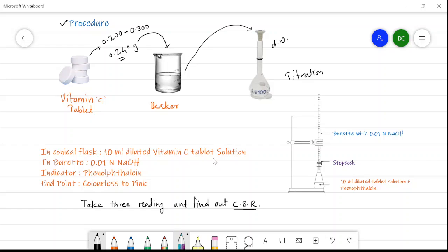For the titration, we arrange the burette, conical flask, and pipette. The burette is filled with 0.01 normal NaOH. In the conical flask we take a 10 ml aliquot of the diluted vitamin C tablet solution — out of the 100 ml total, we take 10 ml for each reading. The indicator is phenolphthalein. Since alkali is in the burette, the end point is colorless to pink; initially the conical flask is colorless and when NaOH is added the color changes from colorless to faint pink.